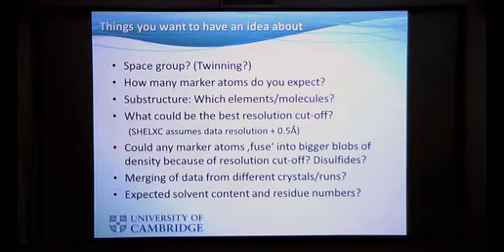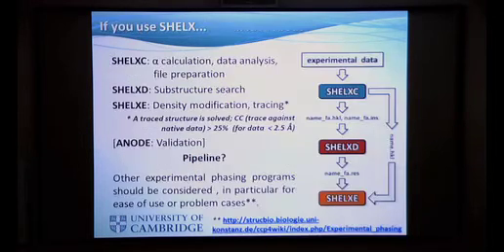What is your expected solvent content? You can actually calculate it by hand. And what is your residue number? I mean, you should roughly know which protein you're possibly looking at. And this is in SHELXC.